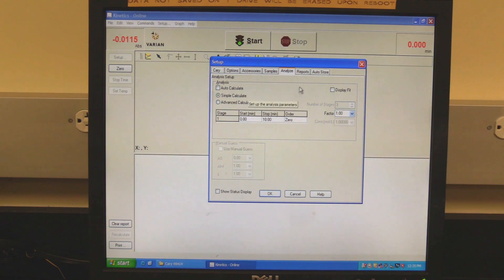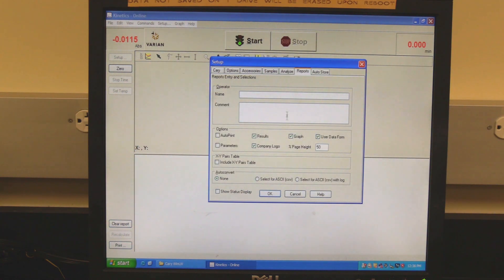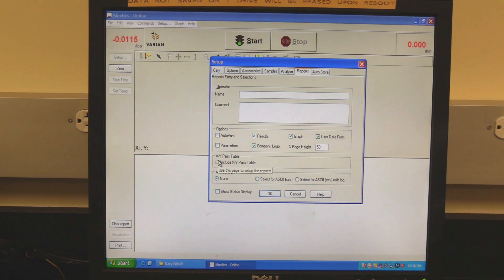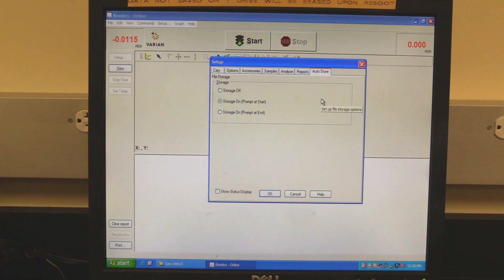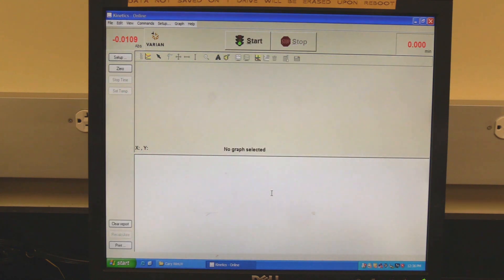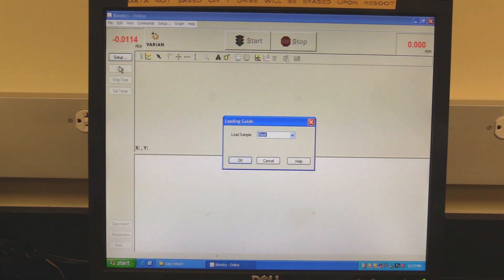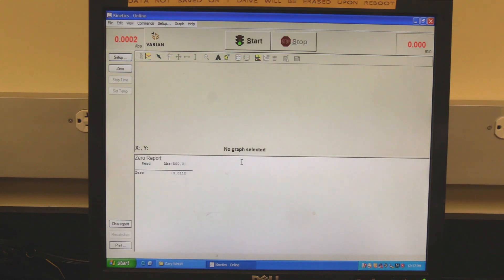Click on the Reports tab. In XY pairs, check the Include XY Pairs table box to include a table of XY values in the report. Click on the Auto Store tab and select when the software should prompt for the data to be saved. Click OK to set the setup parameters. Click on the Zero button and when prompted, click OK. In some cases, the instrument may need to be zeroed twice.